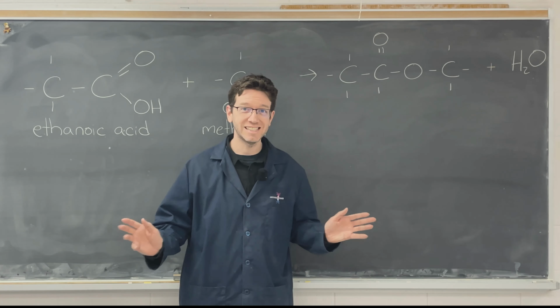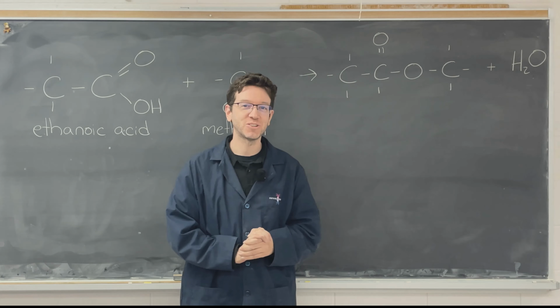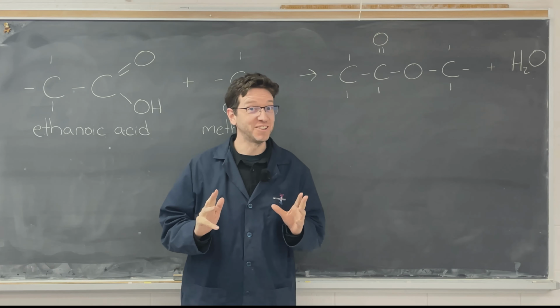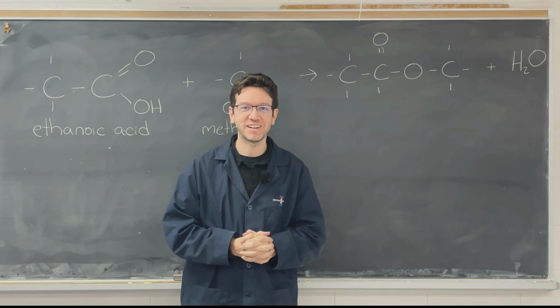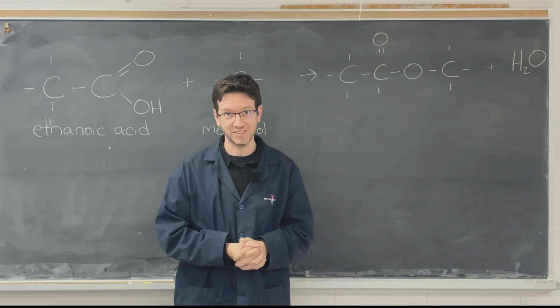Hello, future scientists. In this video for grade 12 university chemistry, I'm going to show you one of my students' either favorite or least favorite labs we do in the semester, and that is making esters.